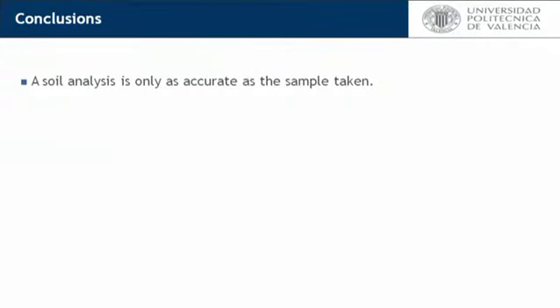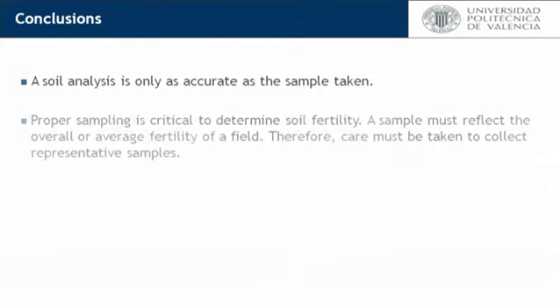It is worth pointing out a fundamental element for all sampling designs. The analysis will never be better than the samples that have been taken. Therefore, you should be very careful to ensure that the samples are representative of the overall plot.